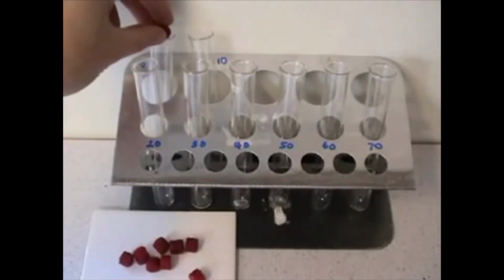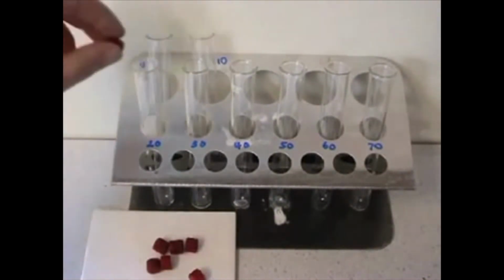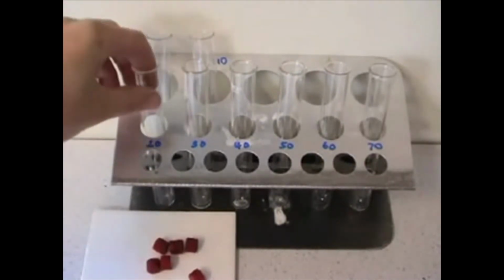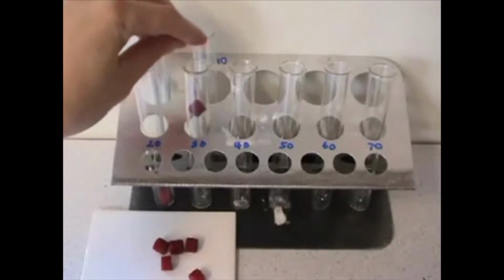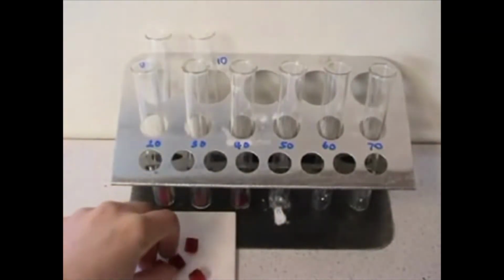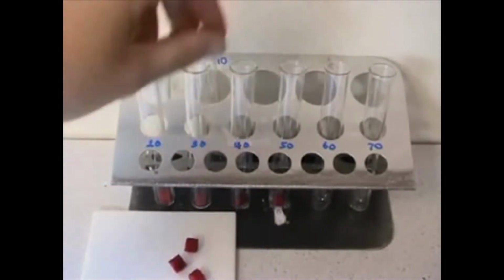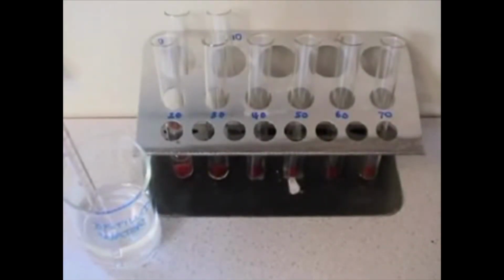Each disc is then placed into a test tube, which will subsequently itself be placed into a water bath at one of the temperatures 0 to 10, 20 through to 70 centigrade. You might see a possible source of error in the way that the discs were placed into the test tubes.